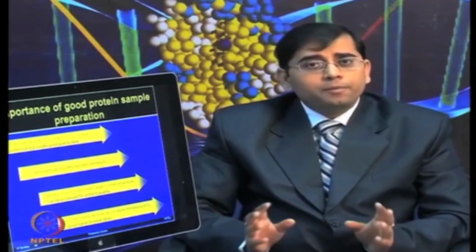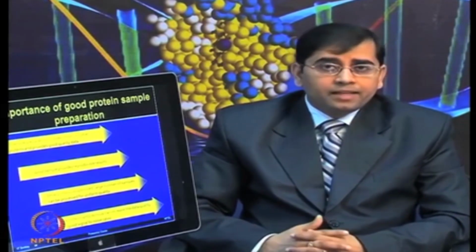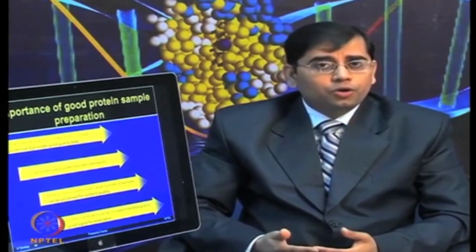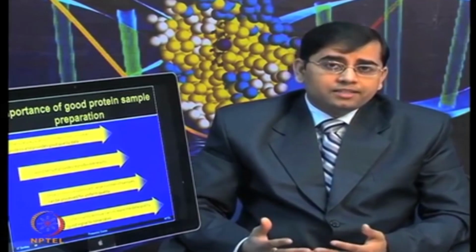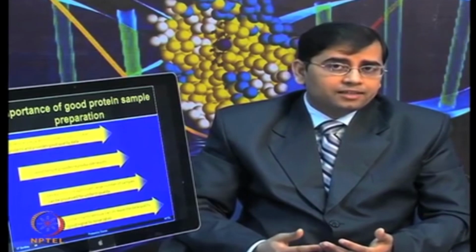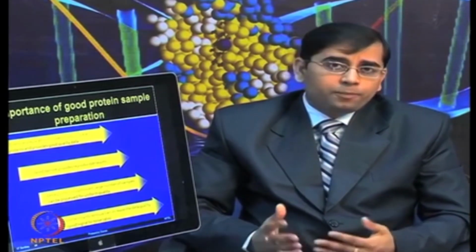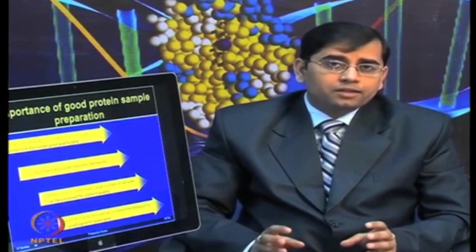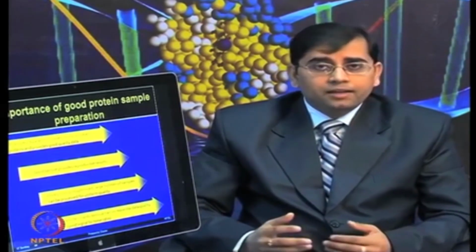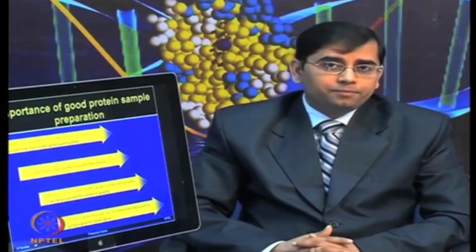Once you have optimized a protein extraction protocol, then you can apply the same protocol for large studies. For example, if you are performing a clinical trial study on 200 patients, once you have optimized the protocol with a small population, then the same protocol can be applied for a large number of samples.